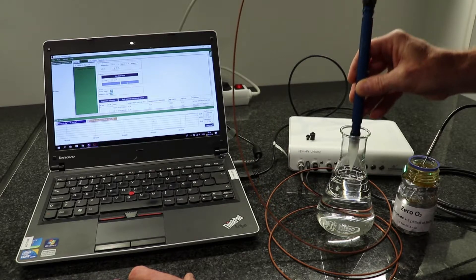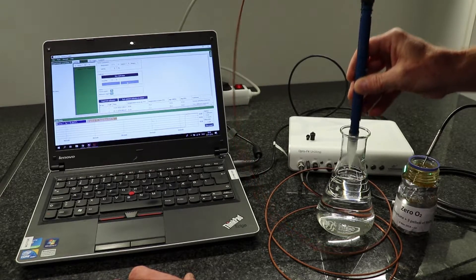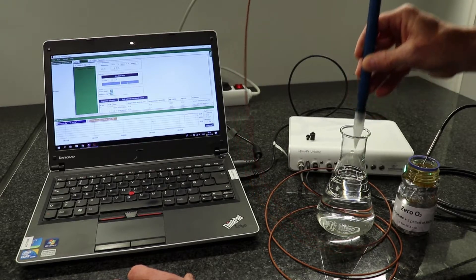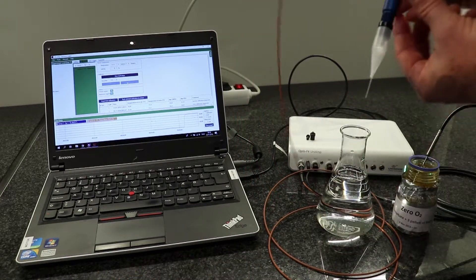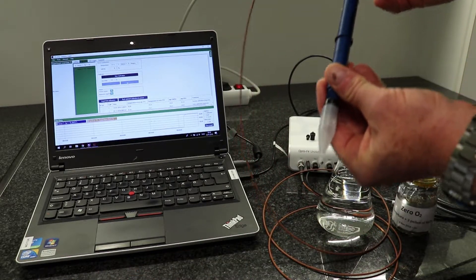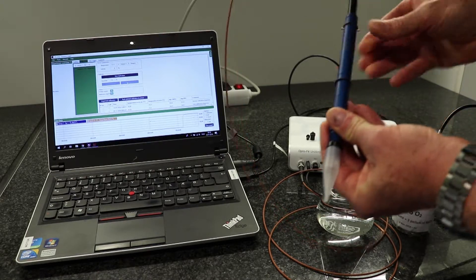Rinse the fiber in the DI water and you are ready to go.